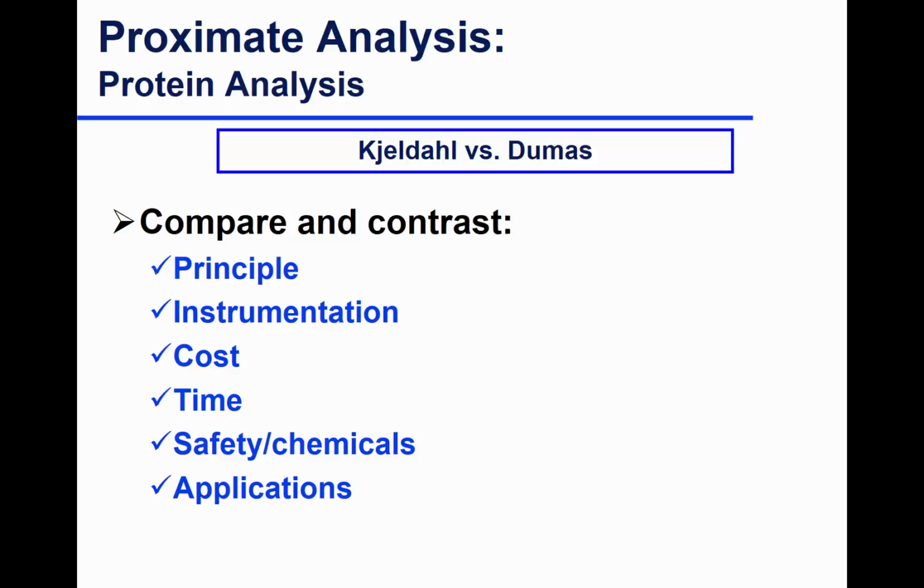Yep, and Kjeldahl worked by digesting the samples, but then the detection is very different, right? And how we're calculating: the Dumas measures percent nitrogen for us, whereas for Kjeldahl, we're measuring the amount of HCl titrated, and we can equate that to the moles of nitrogen that were present in our sample.